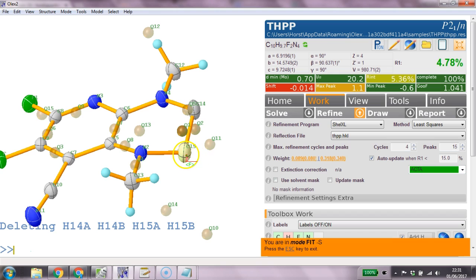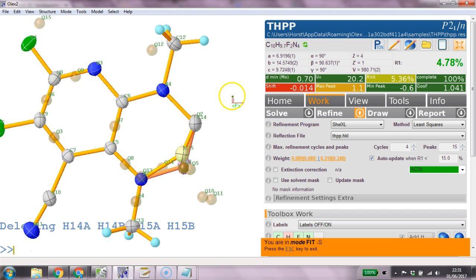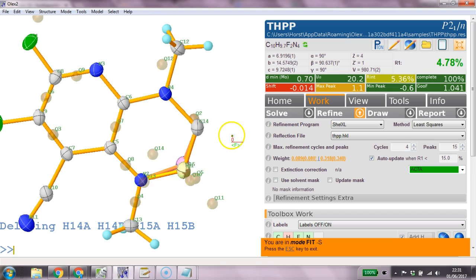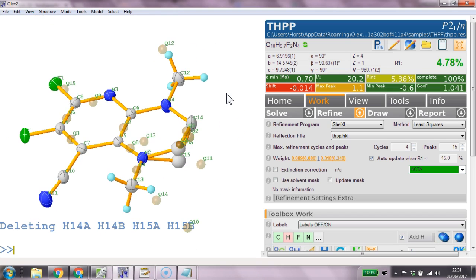So I just need to grab it and move it up. So that's the left mouse and the shift key and then I need to rotate it round like centering a crystal. Again I need the mouse to do this. When I'm done I hit escape and type refine.